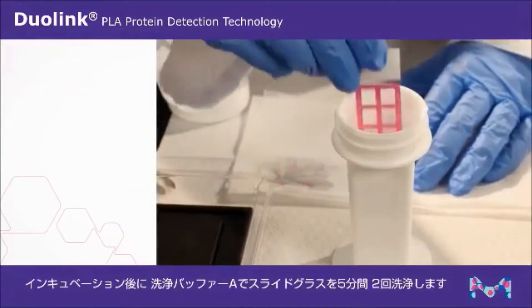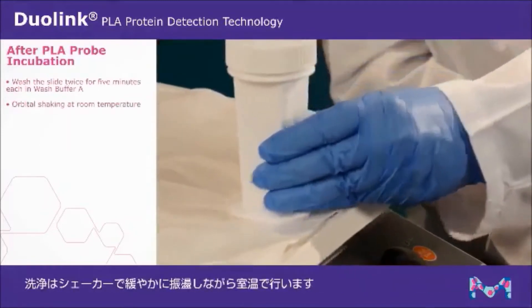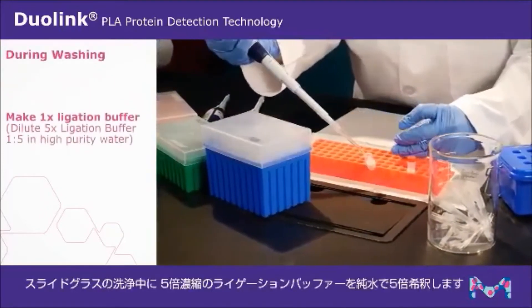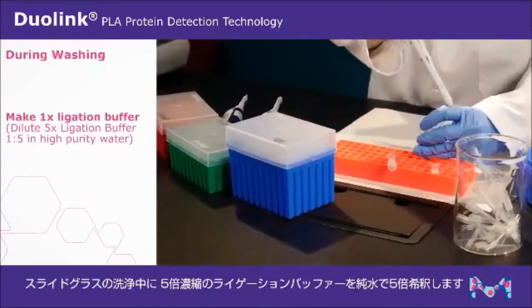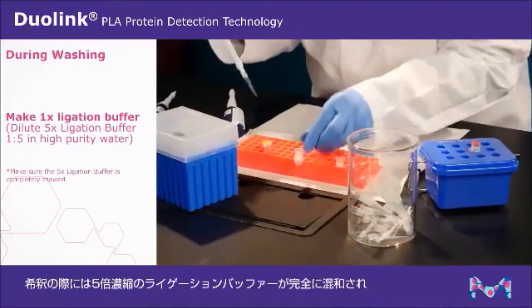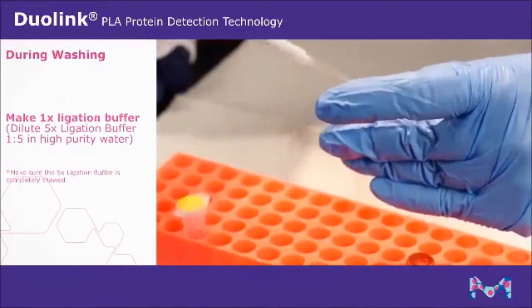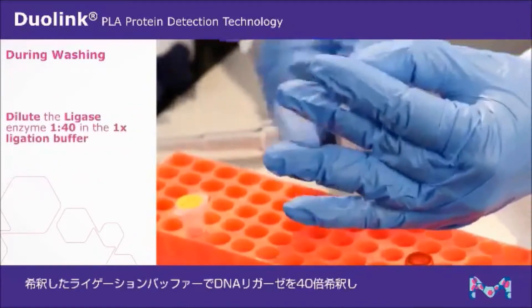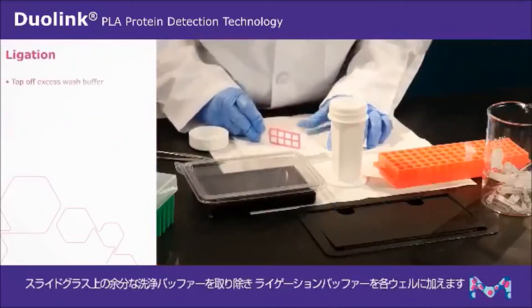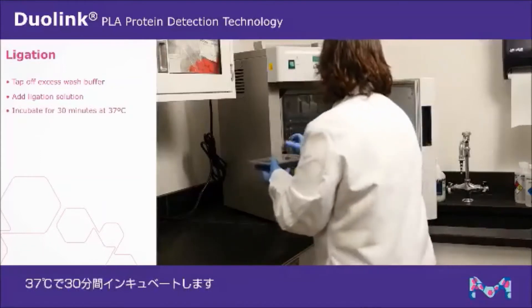After incubation, wash the slide twice for five minutes each in wash buffer A with gentle orbital shaking at room temperature. During washing, make 1X ligation buffer by diluting the 5X ligation buffer one to five in high purity water. Make sure the 5X ligation buffer is completely thawed with no visible precipitate prior to dilution. Dilute the ligase enzyme one to 40 in the ligation buffer, then tap off excess wash buffer and add the ligation solution to each well.